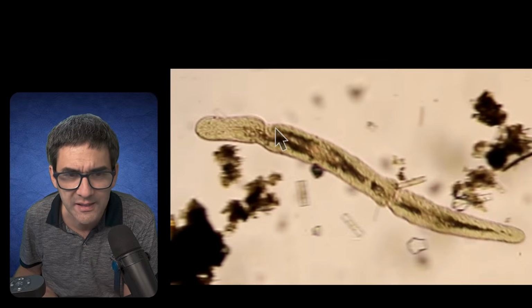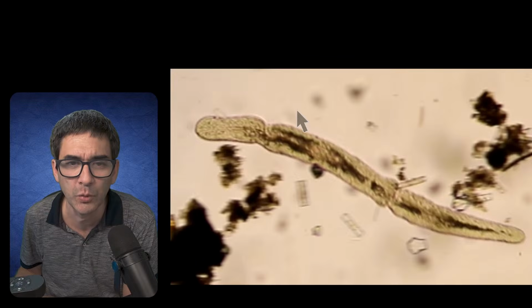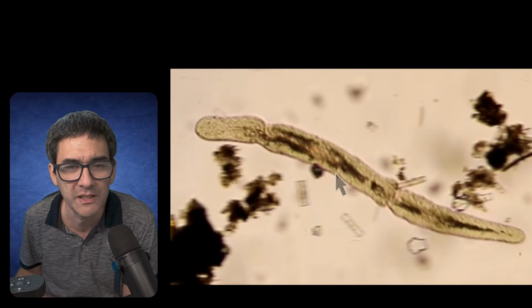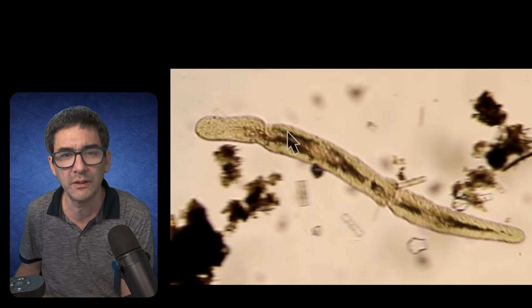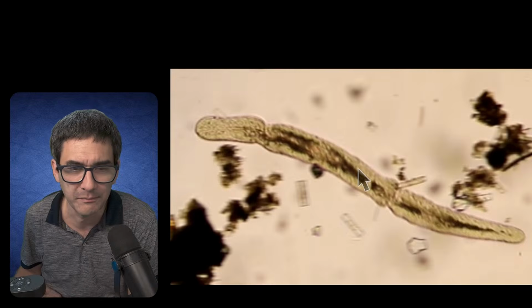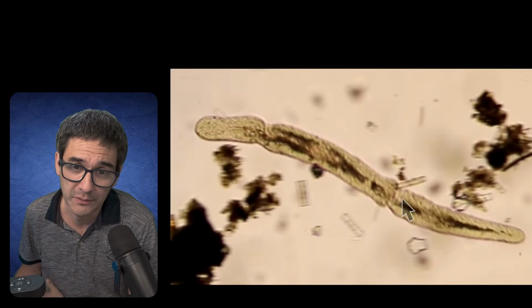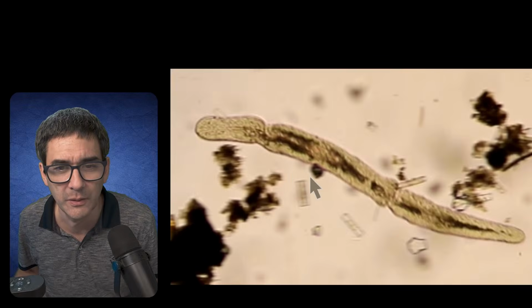Okay, just guessing. Many worms, segmented worms, have bristles on the side, and segments, but this one does not seem to have those. But there seems to be this weird opening here, and this could be maybe the mouth. I'm not quite sure, I'm just saying. So maybe a flatworm. I don't know, but in any case, quite interesting.